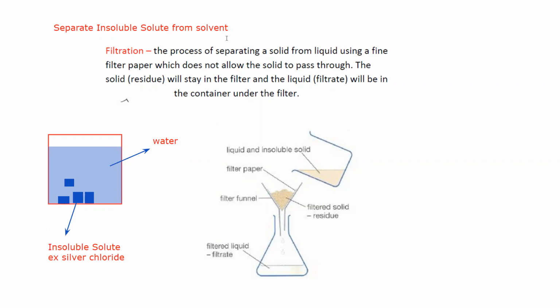So if we have an insoluble solute mixed with a solvent, we use filtration. How do we carry out this filtration? We take a filter funnel. This is a filter funnel.